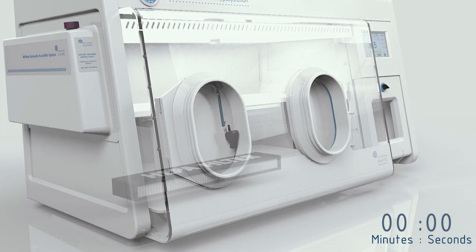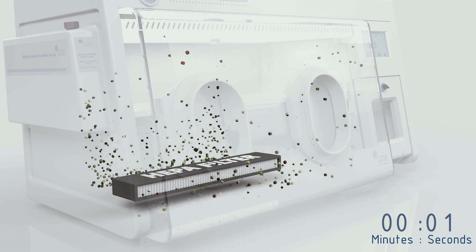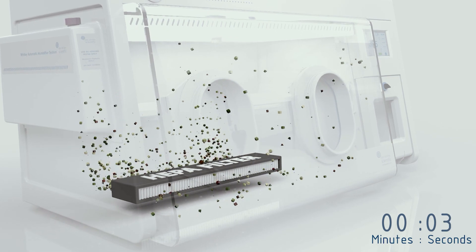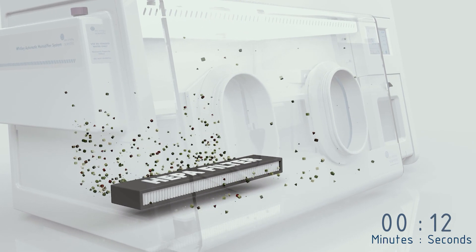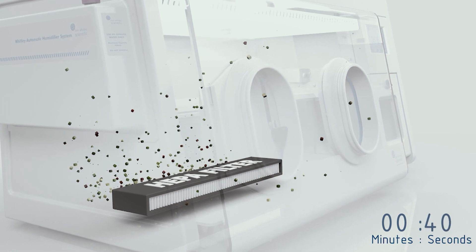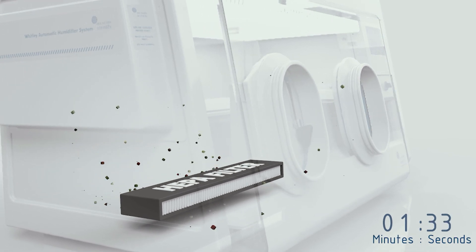Some workstations in our range can be equipped with HEPA filtration to reduce particle counts inside the chamber to levels exceeding the requirements of ISO 14644 class 3.